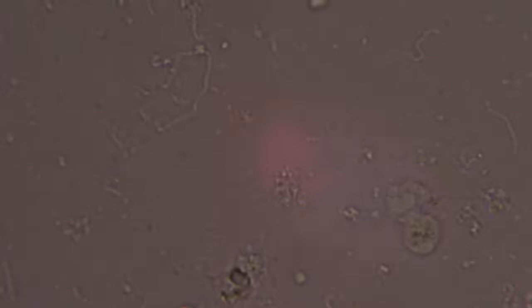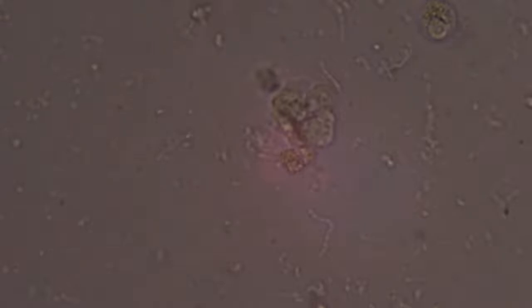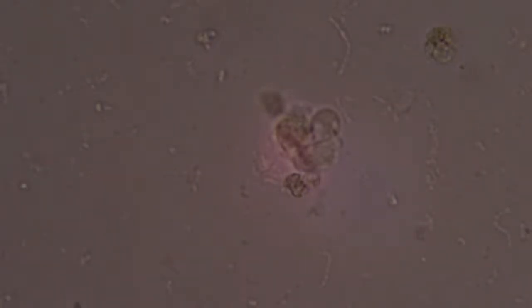Big bacteria too. Some big ball-shaped bacteria they call cocci. That's where you get the name like Staphylococcus and all that stuff. It comes from the sphere shape. And then you get E. coli, which is a bacillus, which is a rod shape. And then you get the spiral-shaped ones like Spirilla, the various spirochetes, and other types of stuff. Boy, there's some big ones there. Big stuff.